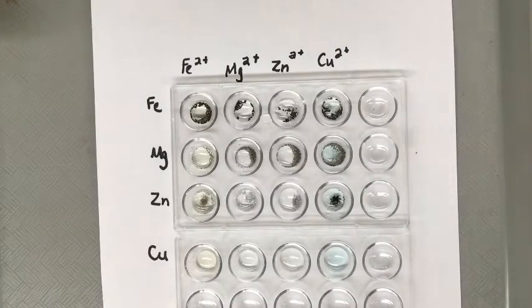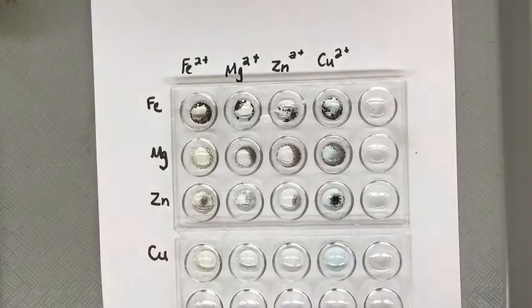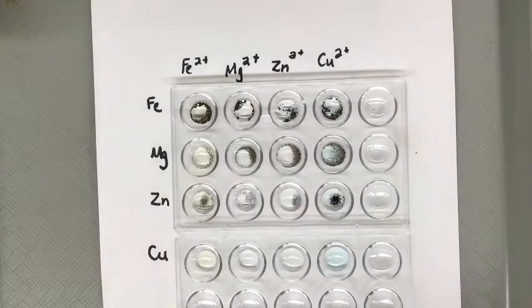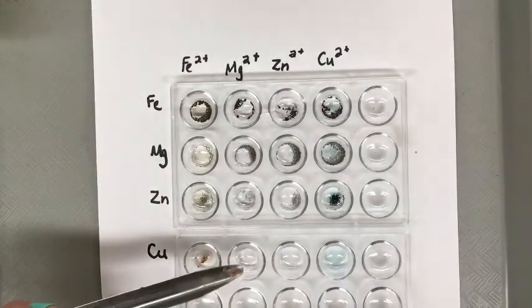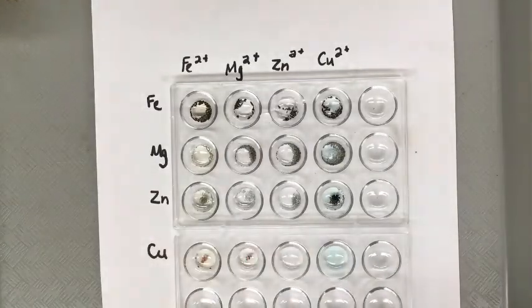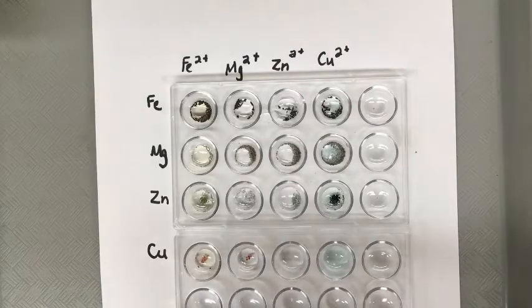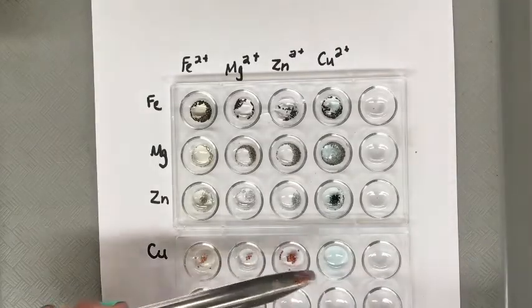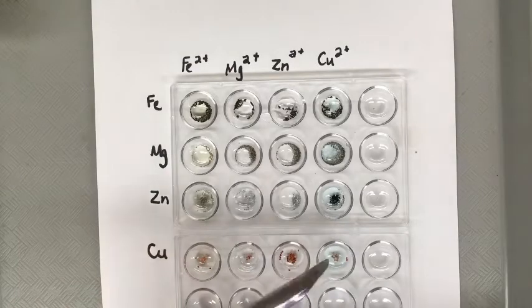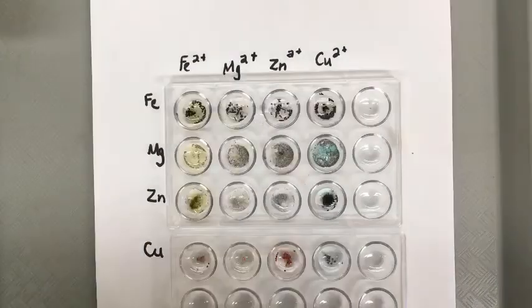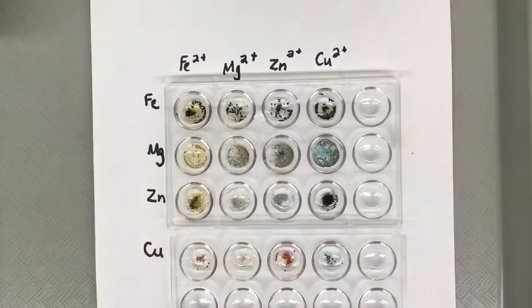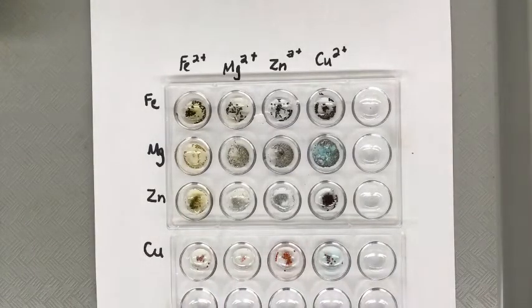Finally, we'll add some copper to the rest of them. And we'll let everything sit. Now that we've let things react for a while, we can go back and look at the results.